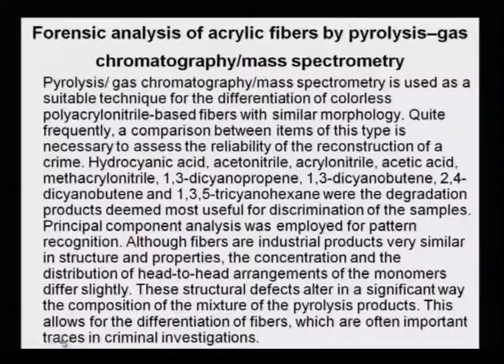But I will not go into the detail of that part; we will concentrate on the chemical analysis. The comparison of hydrocyanic acid, acetonitrile, acrylonitrile, acetic acid, methacrylonitrile, 1,3-dicyanopropene, 1,3-dicyanobutene, 2,4-dicyanobutene and 1,3,5-tricyanohexane were the degradation products deemed most useful for discrimination of the samples.